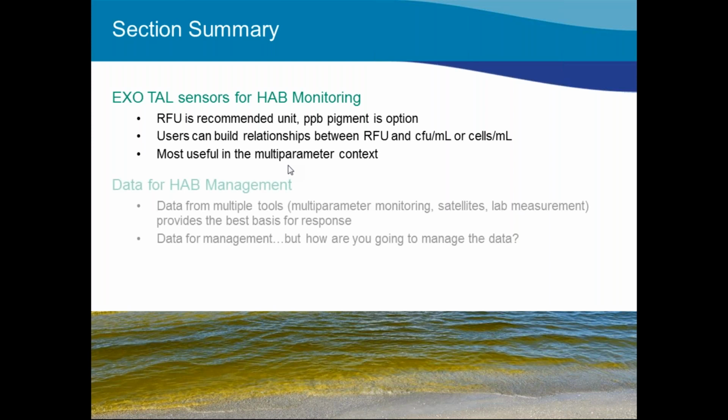So getting the data from multiple tools really gives you the best basis for responding to, monitoring, and managing a harmful algal bloom. But really the question we want to address here is how are you going to manage the actual data? And that is what Chuck is going to talk to you about, and I'm going to hand it over to him so he can show you some examples of how to do that.